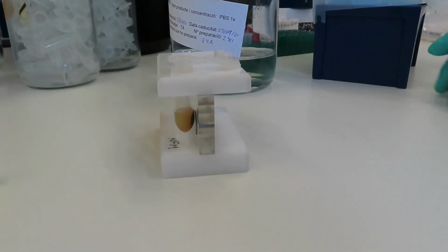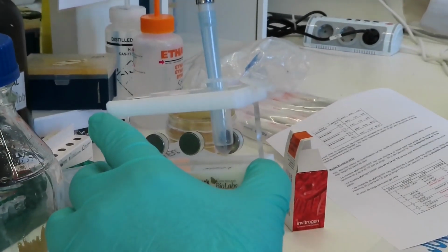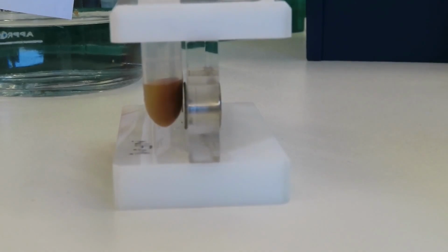Dynabeads are attracted by the magnet. Two minutes must be waited to ensure that all beads have bound. At that moment, it's possible to aspirate the buffer and to resuspend the beads first in ultrapure water to clean them, and later with the binding buffer, repeating the process of separating the beads with the magnet.